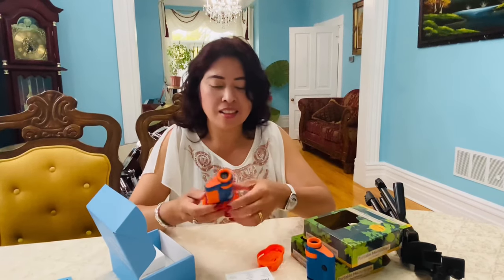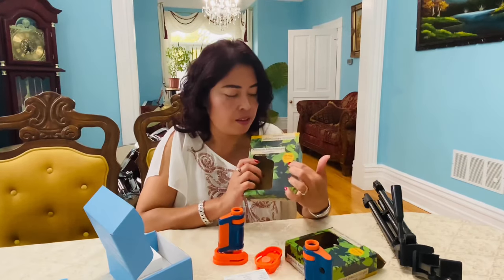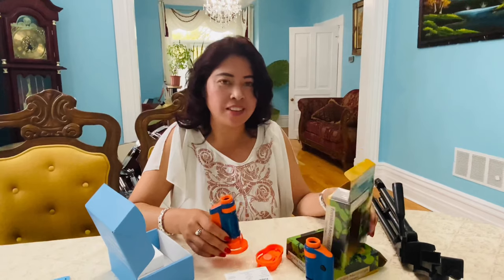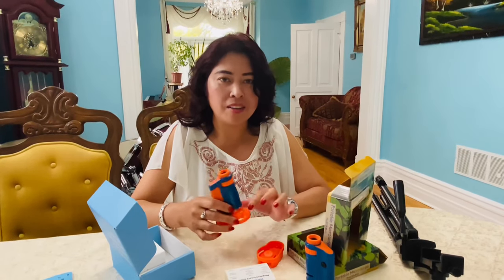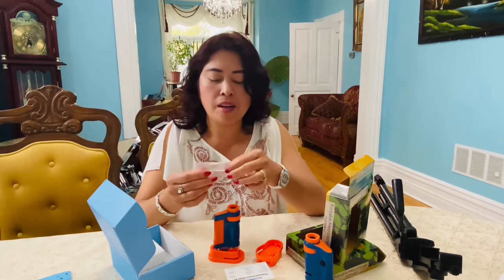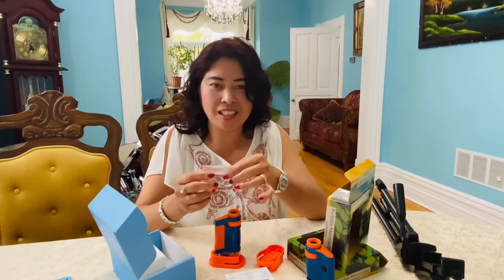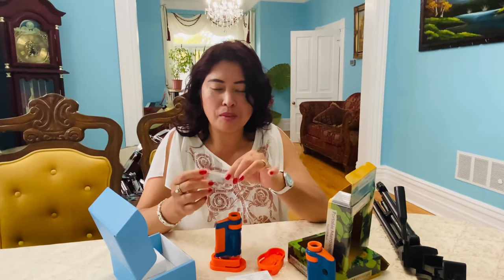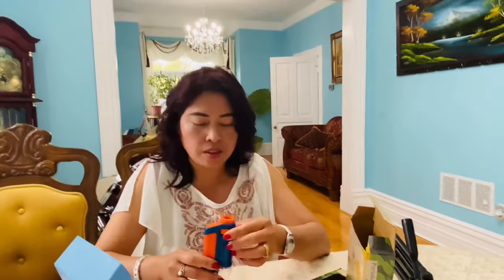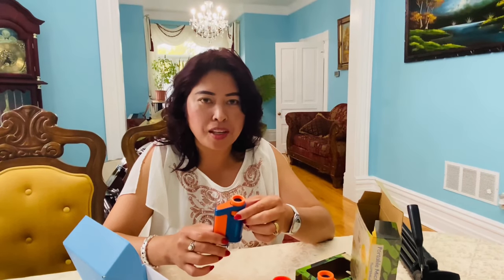This product says it's 8 plus. If you have a young child like ours — we have Jasmine — we need to be around for supervision. I know this is shatterproof so it's not easily broken, but make sure an adult is around. It takes a few minutes to learn how to adjust it.